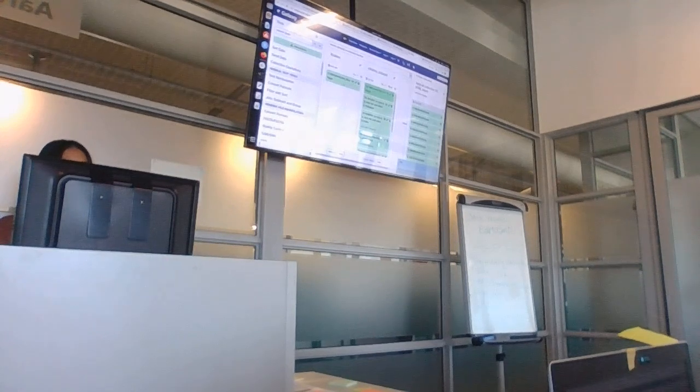Okay, is everybody able to drag the dataset over? Yep. You can then click on switch to at the bottom of the Kraken one to switch to the directory of Kraken.